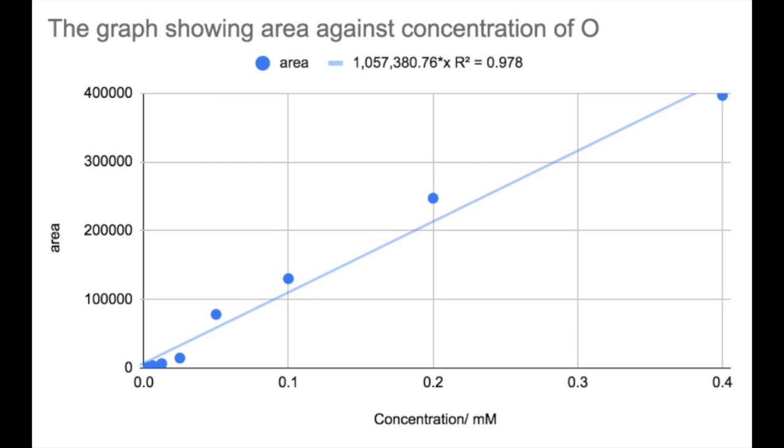A calibration curve was then made for the area of ketone for various concentrations, and the final results were as hypothesized. So this optimized GCMS method can be used for structurally similar ketones. Additionally, results can also be compared with a wider range of substrates, so machine learning can be employed to develop an integrated enzyme model to reduce enzyme engineering speed in industries.